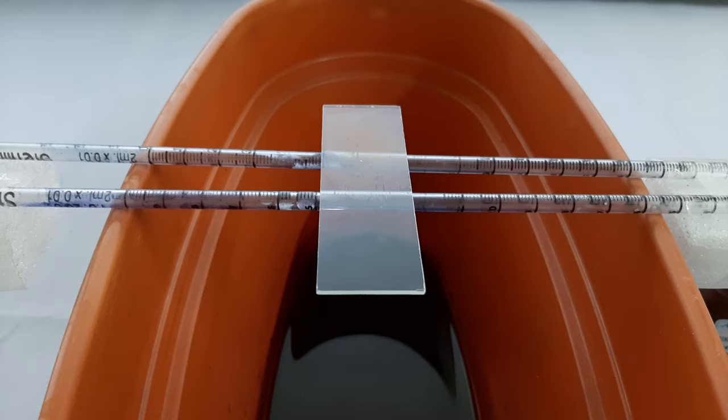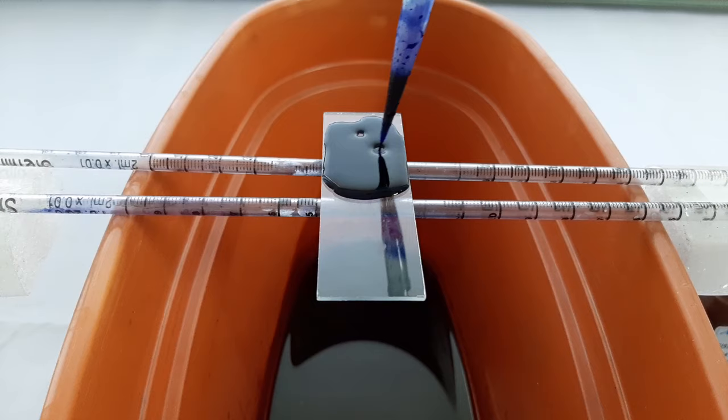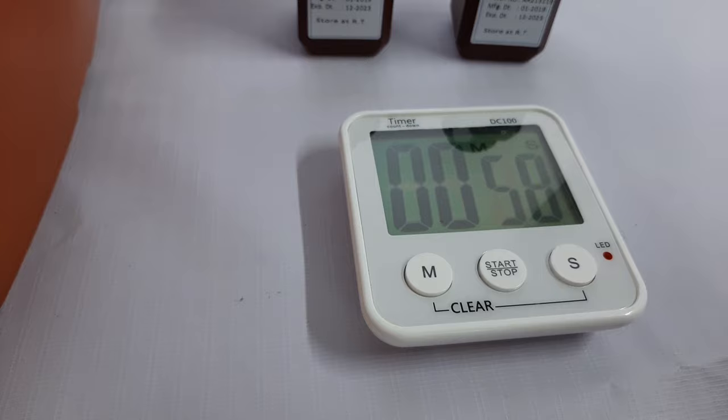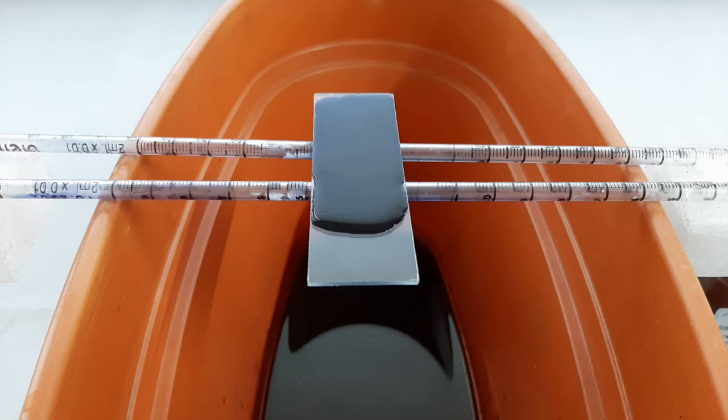Once the slide is air dried, place the slide on the staining station and add approximately 1 ml of Leishman stain. Make sure to cover the entire surface area of the smear with the stain, then incubate for 1 minute.